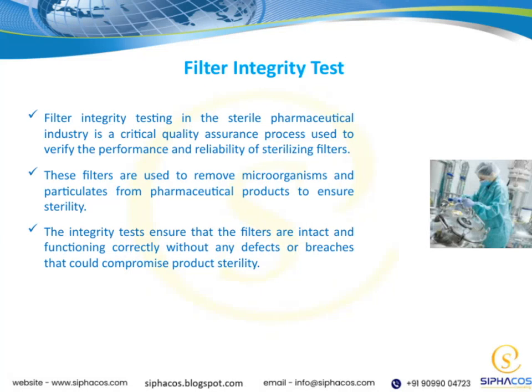Let's talk about filter integrity testing in the sterile pharmaceutical industry. This process is absolutely critical for quality assurance. It's used to verify that sterilizing filters are performing correctly and are reliable. These filters play a vital role in removing microorganisms and particulates from pharmaceutical products, which is essential to ensure their sterility.